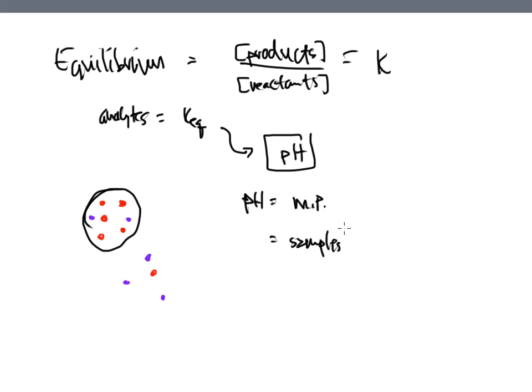You kind of want to bring them to a certain value before you do anything at all with them, and if so, then this is one of the reasons. You're just controlling how long they retain onto the surface of that particular column.